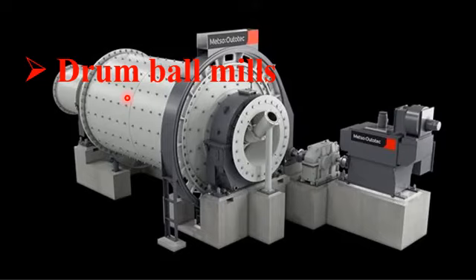Commonly, dear student, please note that the grinding balls used in drum ball mills are usually from 10 to 30 millimeters in size. So usually the balls used for grinding in drum ball mills have a diameter of around 10, 20 or 30 millimeters.